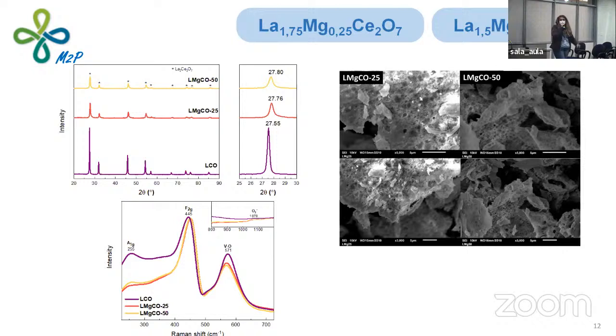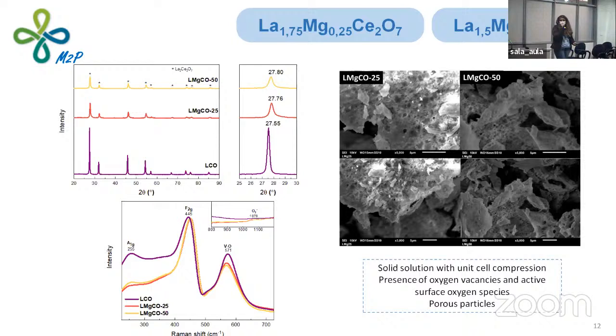And this is our third group of samples. We also reached a solid solution with unit cell compression. We detected the presence of oxygen vacancies and active surface oxygen species, and also the porous-like particles.